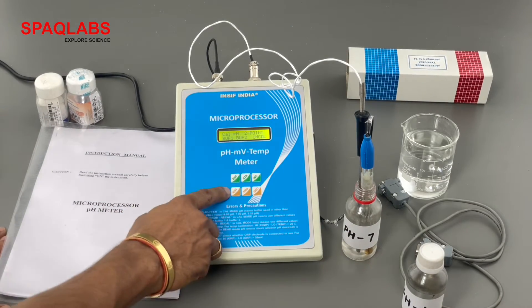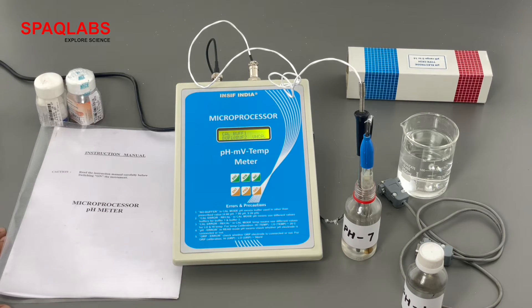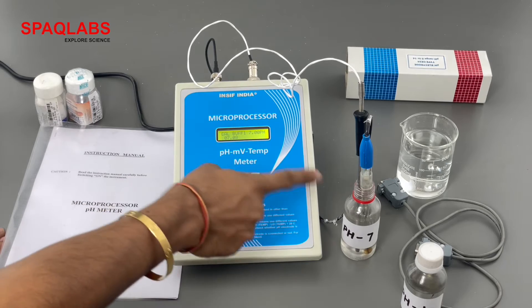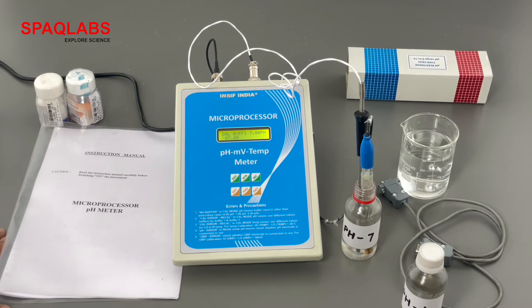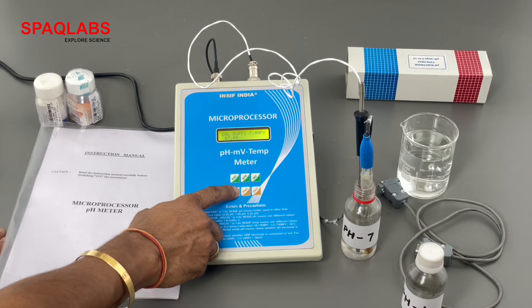Now buffer 1 is selected — press enter. pH 7 is shown, and the real-time calibration value is displayed as 7.08. Wait for 30 to 50 seconds for it to stabilize, then press enter to calibrate.